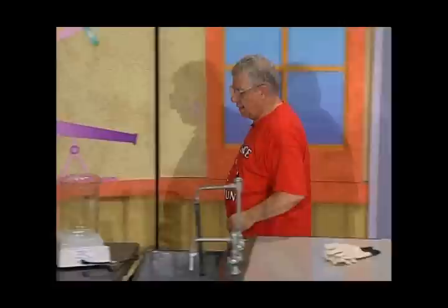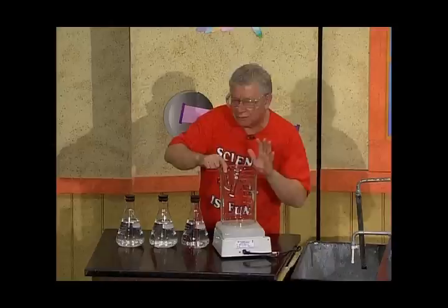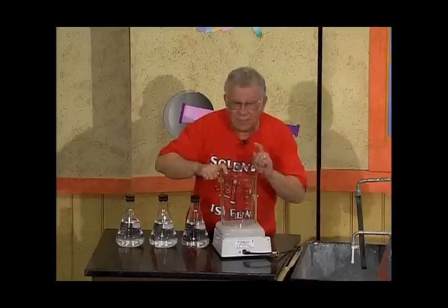I have a large glass beaker. This beaker is empty, and it has a volume of 4 liters. I want everybody right now to look at this beaker, because if you look at it right now, you just learned how big 4 liters is. And you cannot unlearn it. You may forget it. That's different. Right? You think about that.